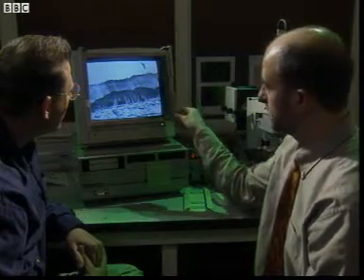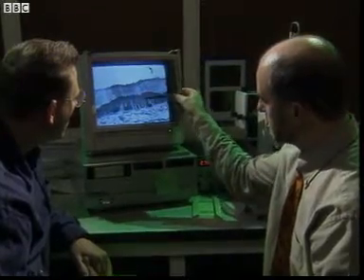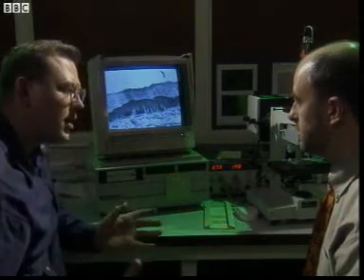Right, what we've got here is a section through some human fingertip skin. At the top here, on the outside, there's layers of dead cells. These are the live cells called keratinocytes, and underneath is the tissue called dermis. So all these different cells in the human body doing different jobs, can they all divide? Well, most of them can divide, but some cells don't divide after they've finished their useful job.